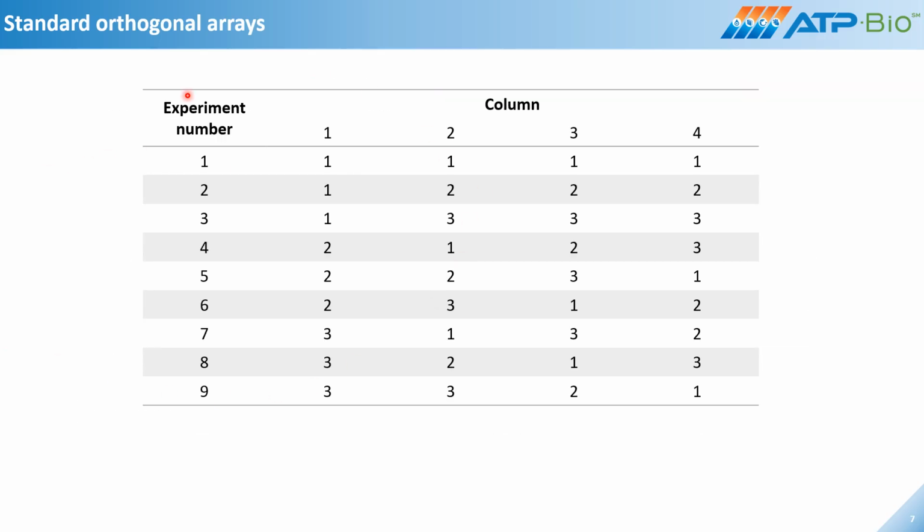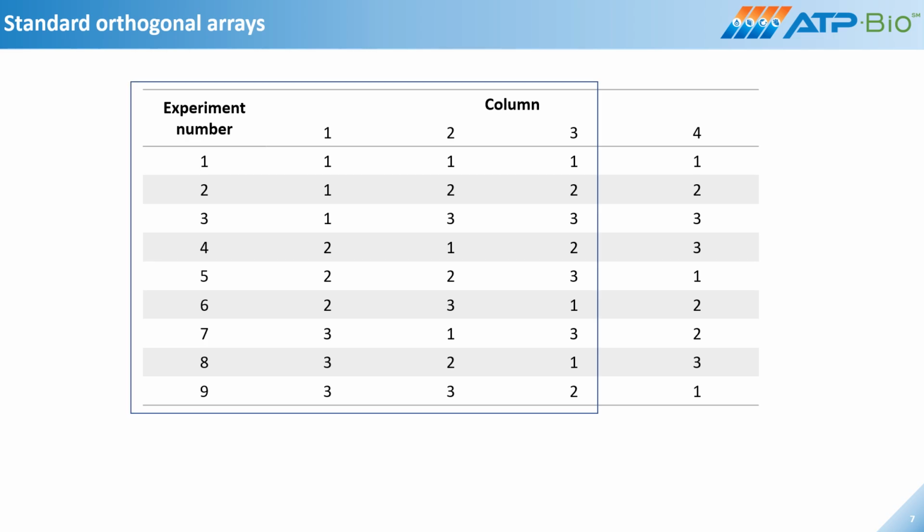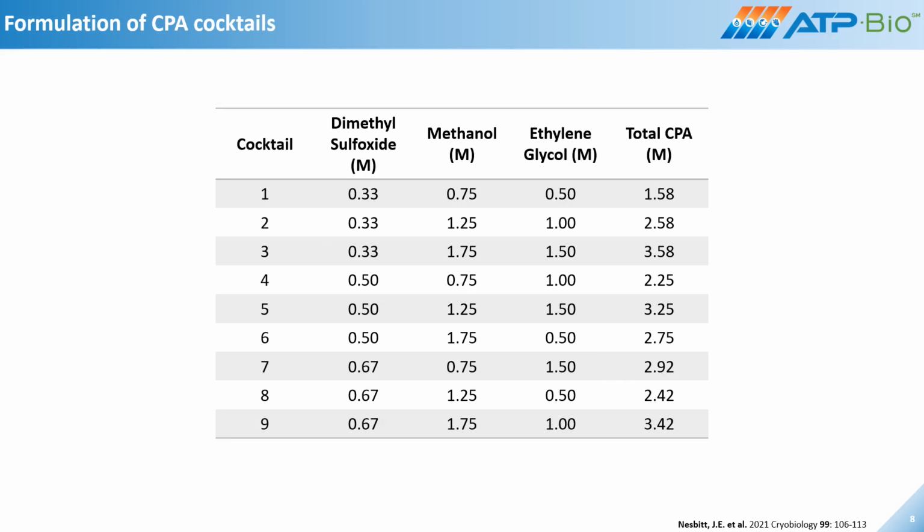Now, based on the standard array that we have selected, here we see how the L9 array is organized and the order in which these levels are added for each factor. Since we have 3 factors, we will make use of only the first 3 columns. And based on this array, we will construct the array for the factors and levels that we have identified.